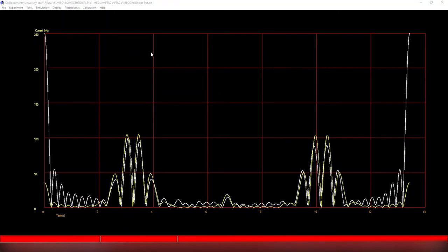Okay. As well as those stated, the ringing can be seen to be a lot worse here for experimental data, and I again strongly advise using the convolutional Gaussian function to just absolutely strip down this background. I believe this will still be here, but you can just truncate that using time series and just set it to 0 in essence. It will make your life easier, and the computer will have a lot better time focusing in on the important section here.